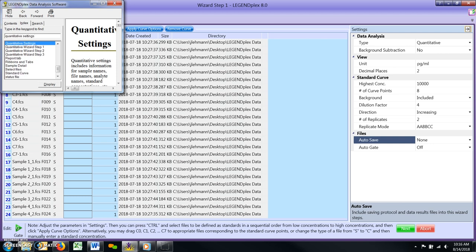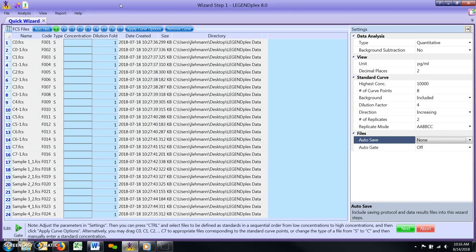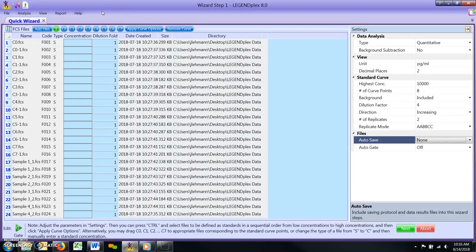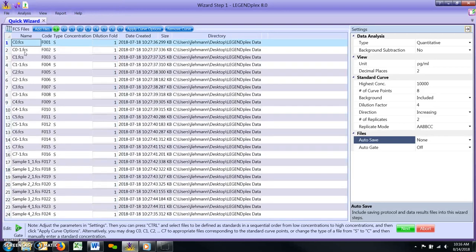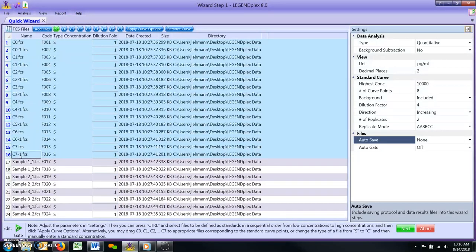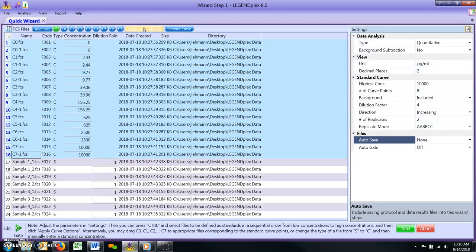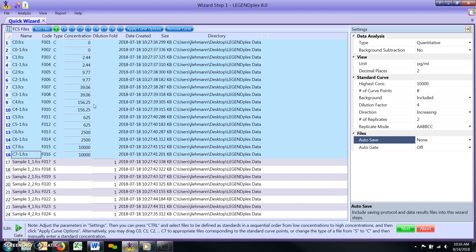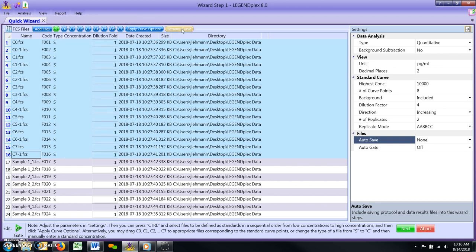Defining the Standard Curve. Once you have adjusted all necessary parameters in the settings window, you will need to define which FCS files belong to the assay's standard curve. The easiest way to do this is to shift-click all the standard curve files in the list, and then click the Apply Curve Options button at the top of the screen. This will assign a standard curve point, C0 through C7, to all highlighted files based on the adjustments just made in the settings window. If you make a mistake, simply click the Remove Curve button to undo the assignment. Make any necessary parameter adjustments in the settings window and then click Apply Curve Options again.